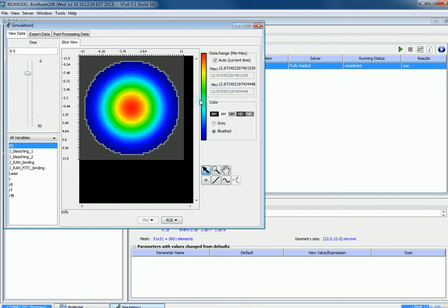But you could run a different simulation and get a difference that starts within the tenths, and it will still have the same color scheme. So it's always important to check your maximum and minimum values.